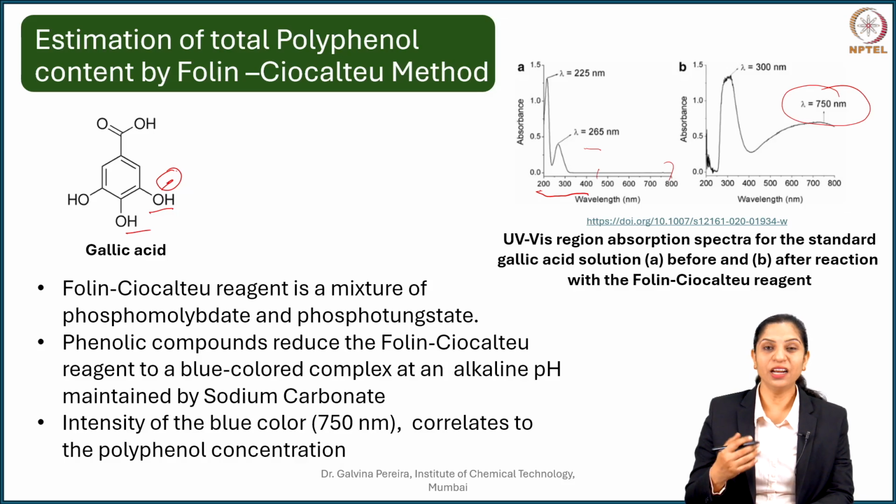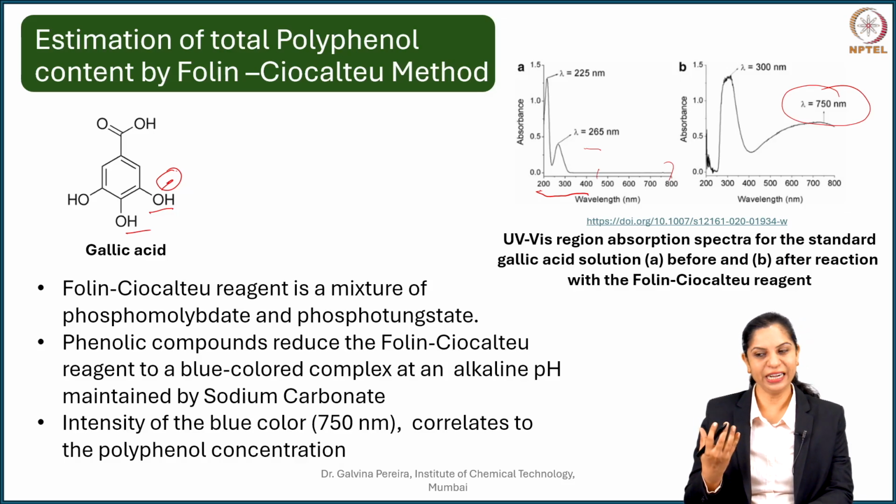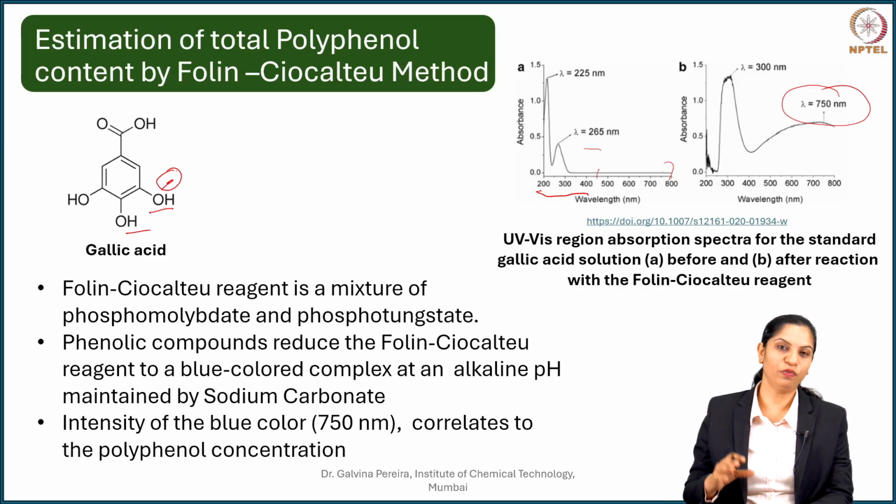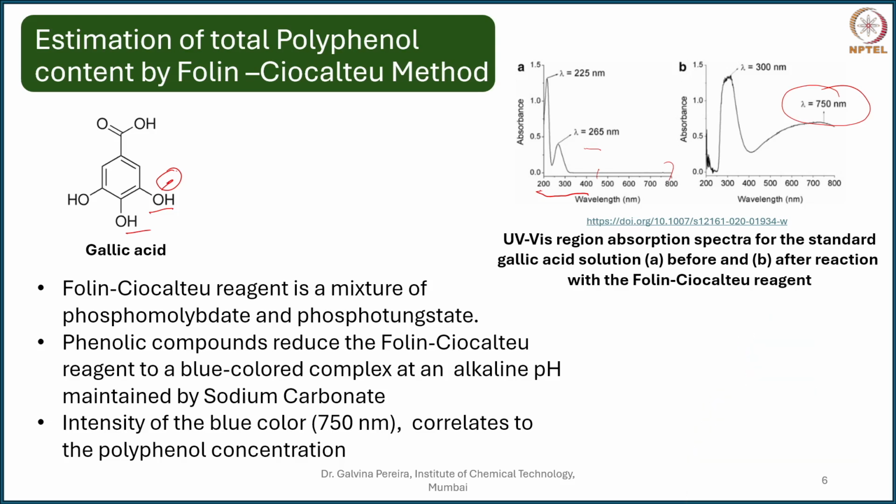Now you will see that color development requires a little time. So meanwhile the solution is kept in the dark to rule out any reactions happening in the presence of light, and then you remove it and you see the UV max. This UV max is coming around 750 nanometers, which can also be used for quantification. So you can do the same thing.